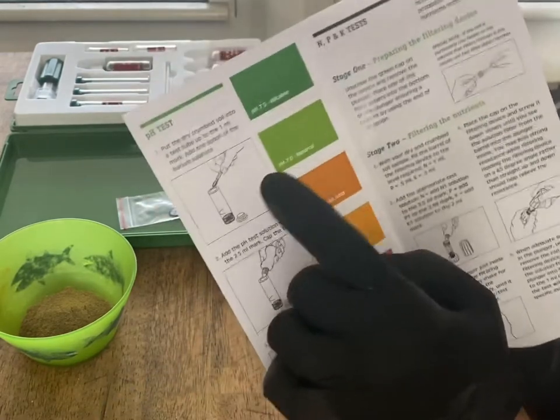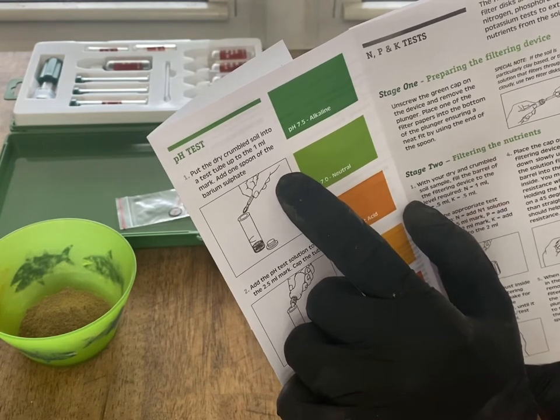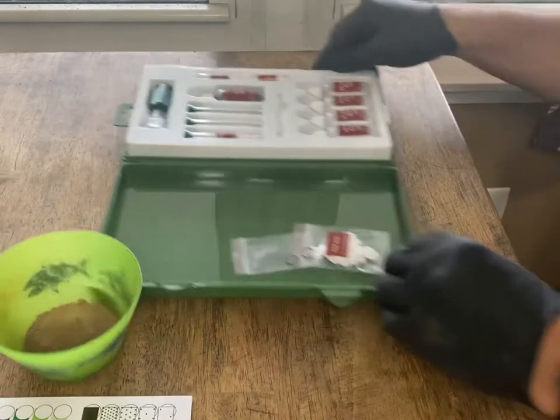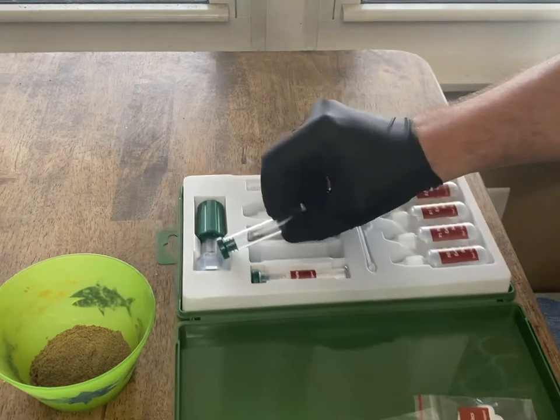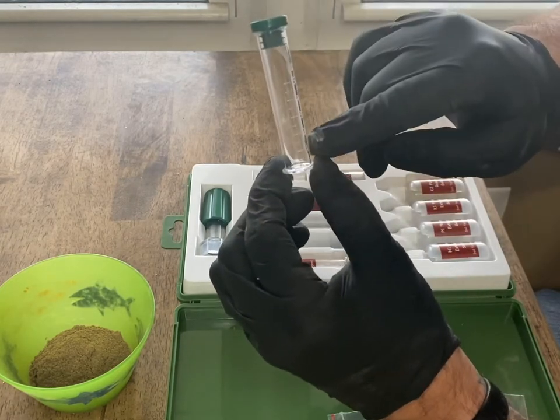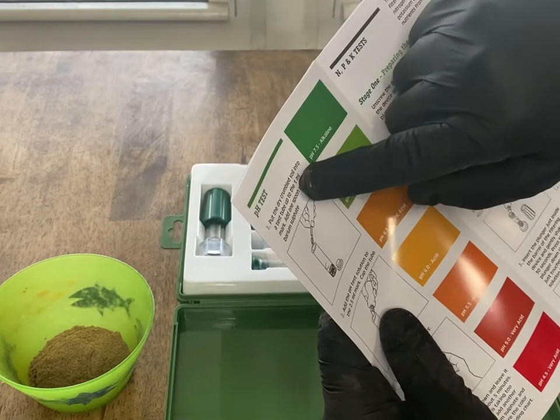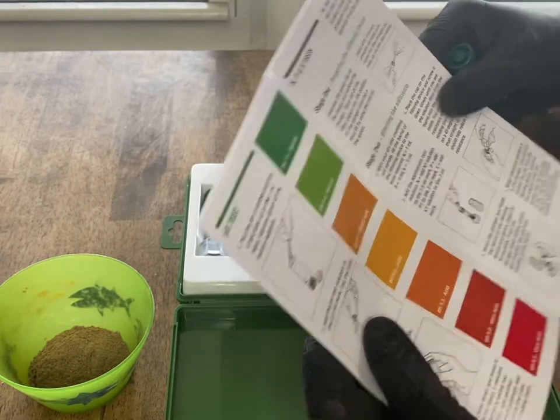Alright, right here — pH test, step one: put the dry crumbled soil into a test tube up to the one milliliter mark, add one spoon of the barium sulfate. This test tube is not labeled, but it does say milliliters and then one, two, three, four, five. Put the dry crumbled soil into a test tube up to the one milliliter mark and add one spoon of the barium sulfate.